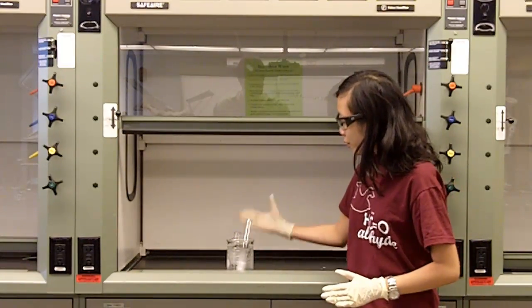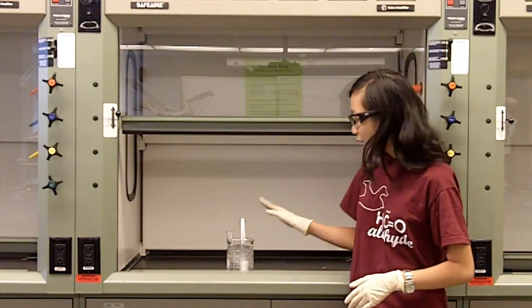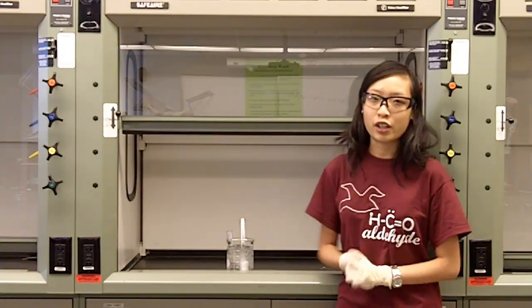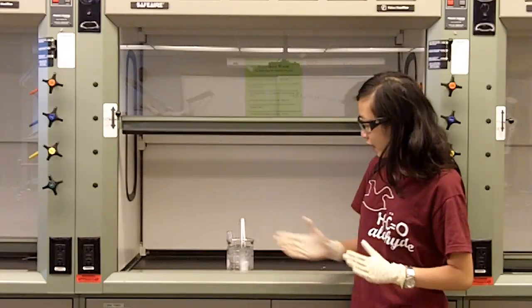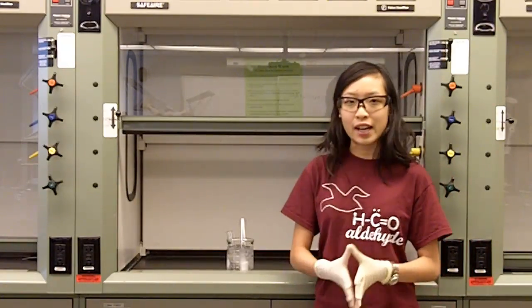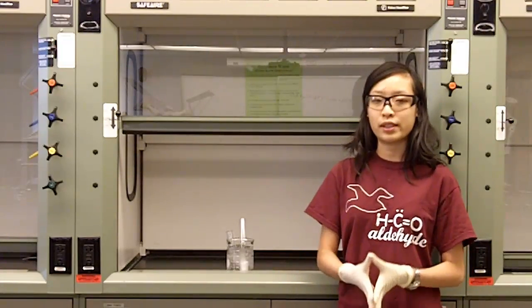We have two tubes. One tube has acetic acid with a little water in there, and we can call that vinegar. The other tube has glacial acetic acid, which is really pure acetic acid.